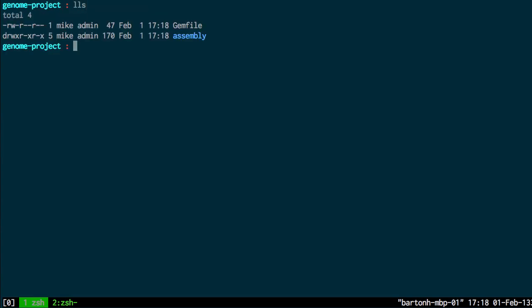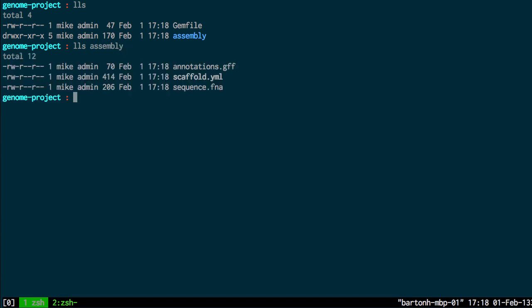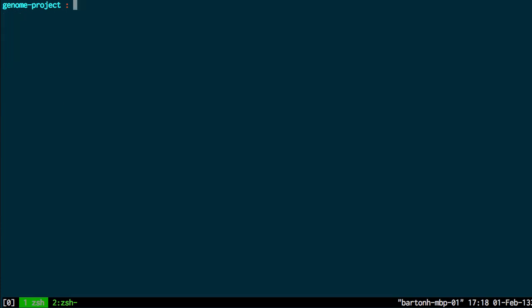This has created a project containing a gem file and an assembly directory. The assembly directory contains three files and I'll explain what each of these files do.